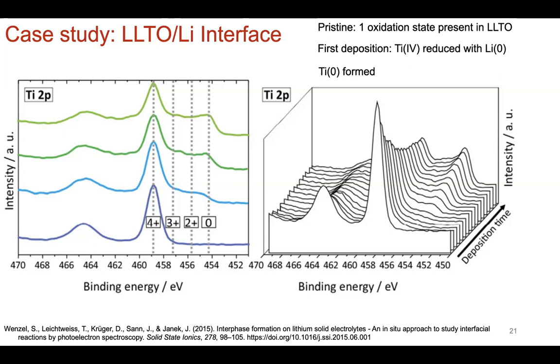Because solid electrolytes should have high ionic conductivity. And if you have a metallic species in there, one, now you have an inhomogeneous material, but two, you have pockets where it's electronically conductive, which is extremely detrimental. Okay. So that is a first pass. That's what we can see.